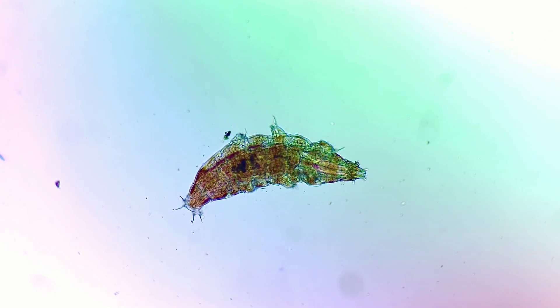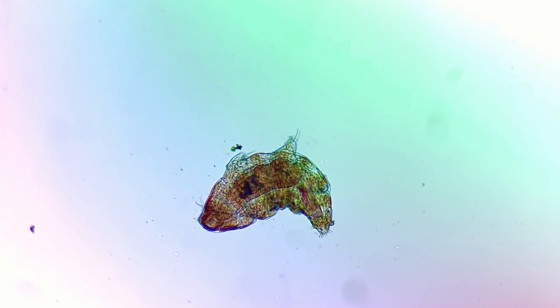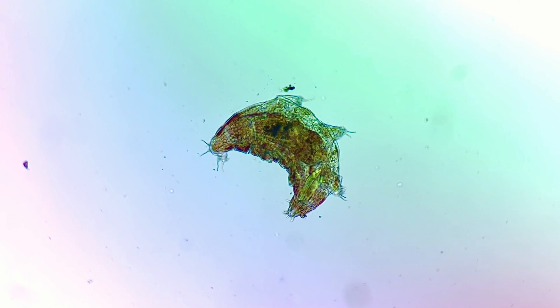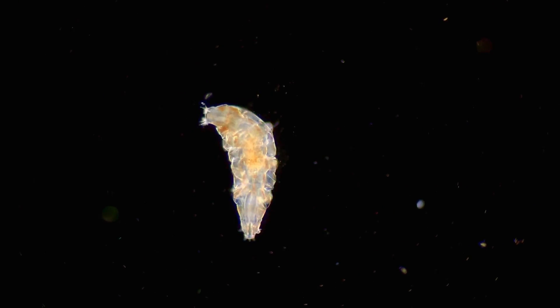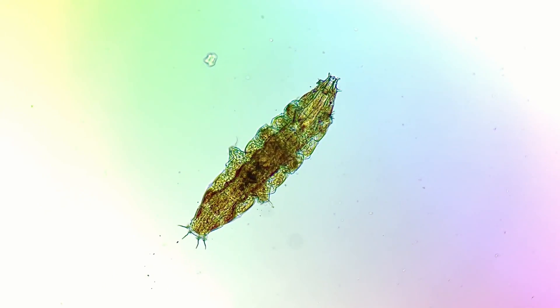There you have it friends, a beautiful water bear to look at under the microscope. You can see the amazing difference between the stereo microscope and the biological microscope. We can now observe the water bear using dark field technique, or bright field with a touch of polarisation — that's what causes the rainbow hue shown here.